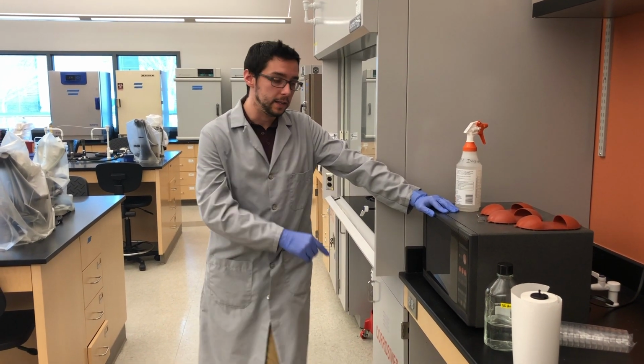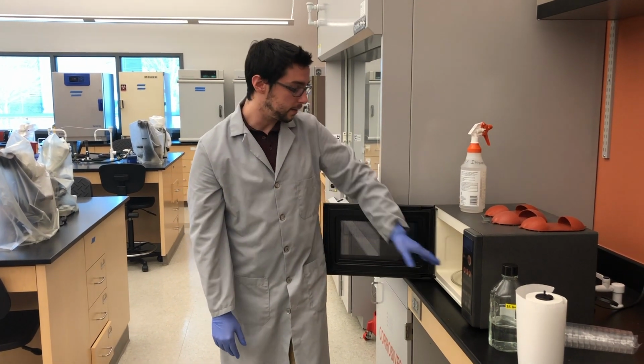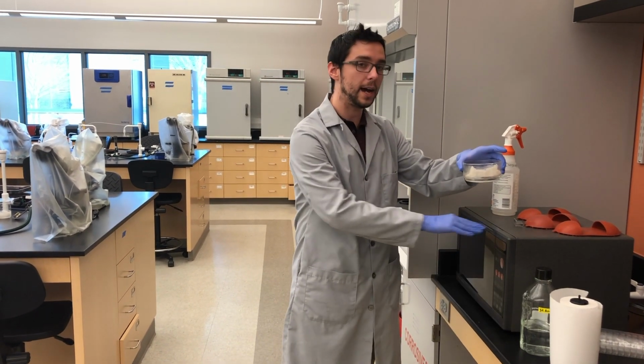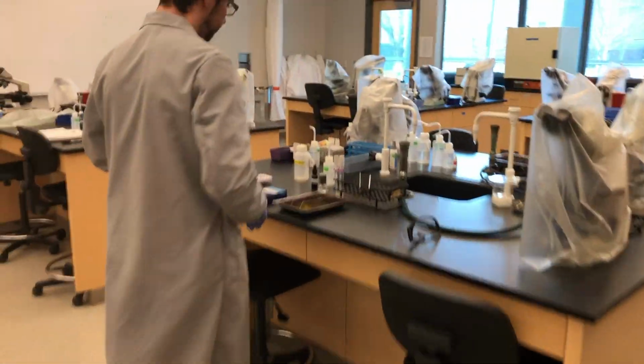When we stop applying heat, the mycolic acid is no longer excited and warmed up and is no longer allowing things through, and now the dye that made it through is trapped underneath the cell wall.